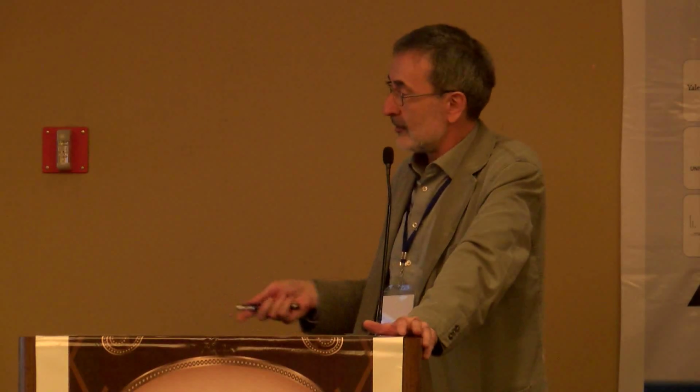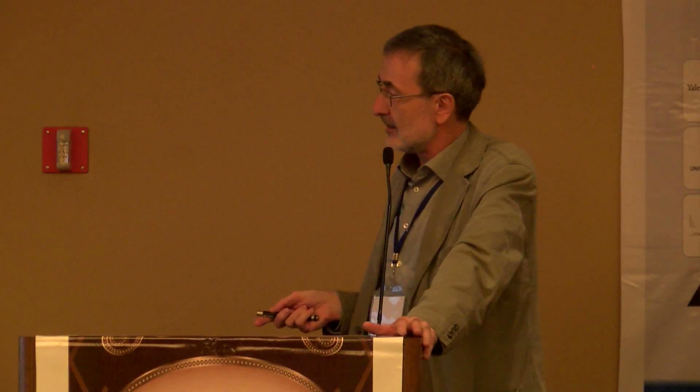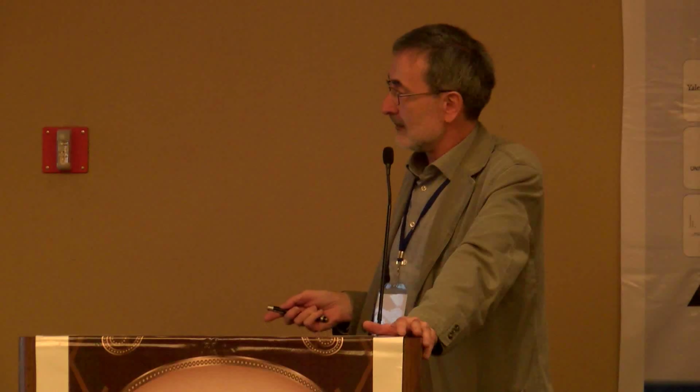Norway spruce is my last project which I'm going to present here today. Norway spruce is endangered by the attack of the bark beetle, Ips typographus, which is associated with a fungus that finally kills the tree. After infection by the fungus, the bark tissue starts to change. This is shown by this fluorescence microscopic image, and it shows that there are several different types of cells which have different fluorescence.